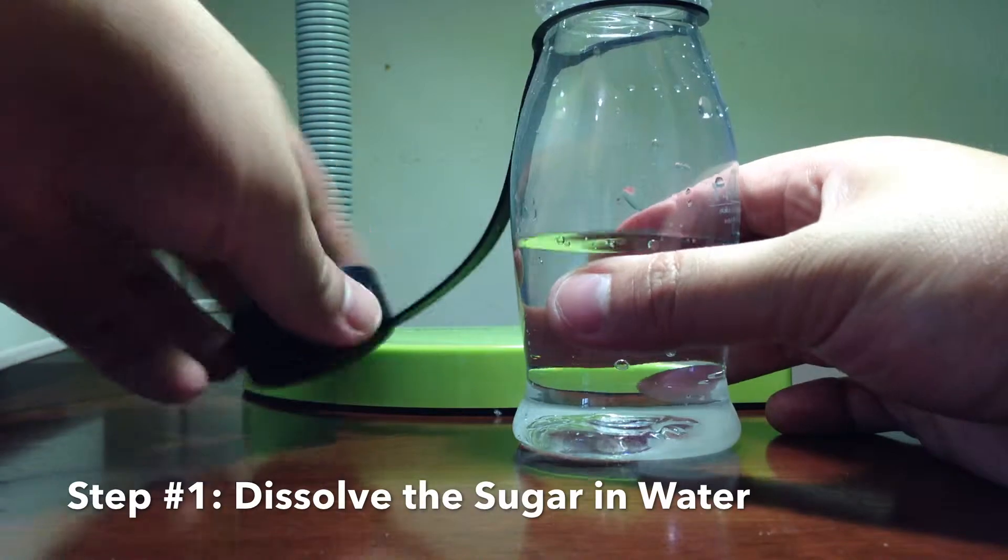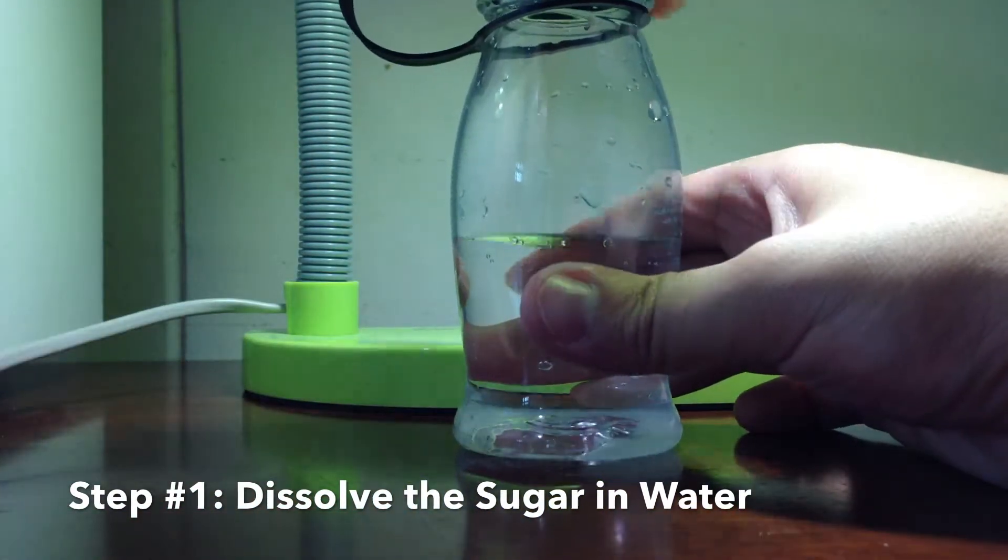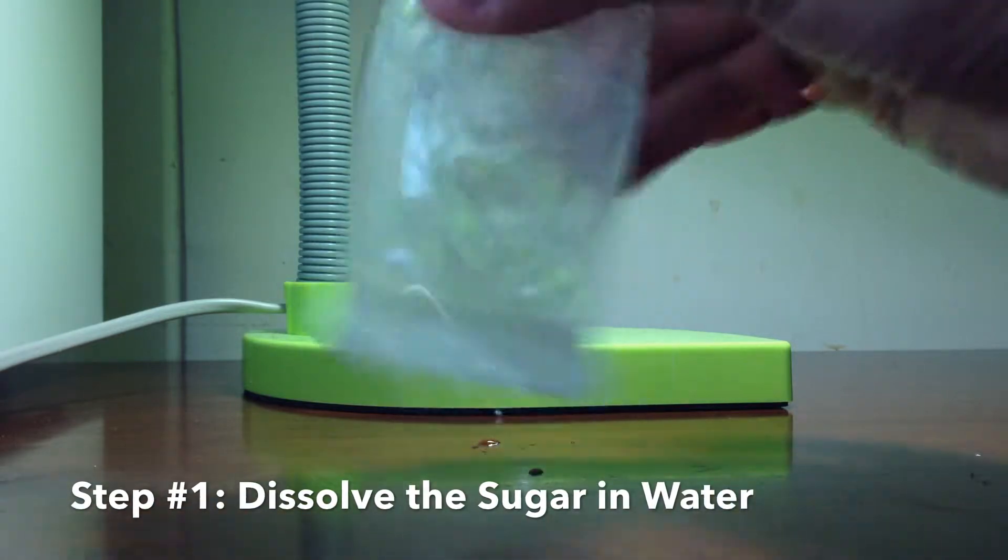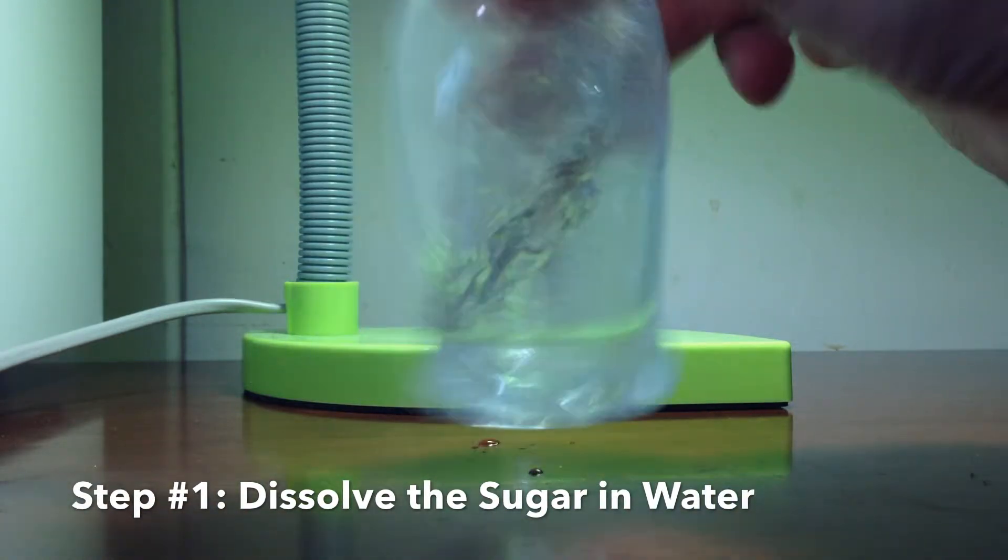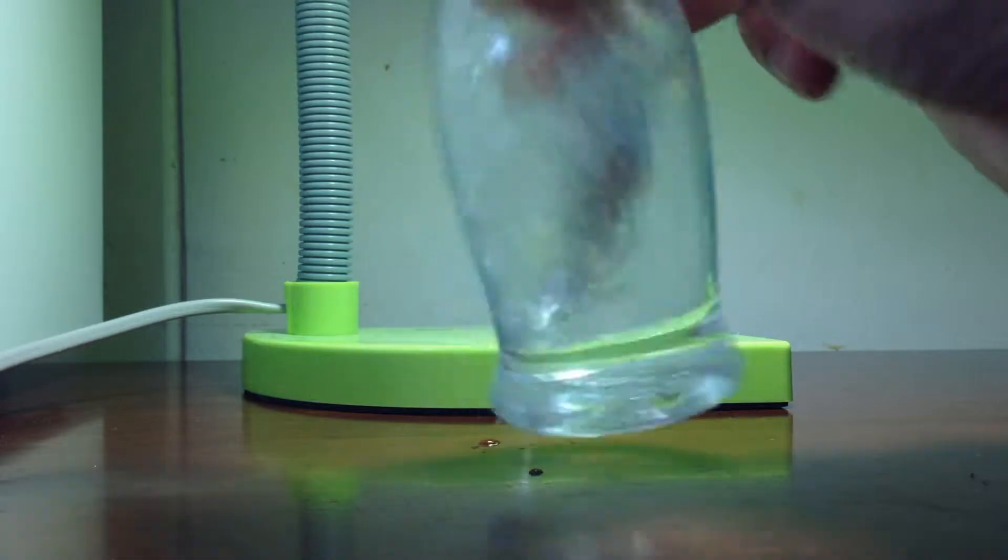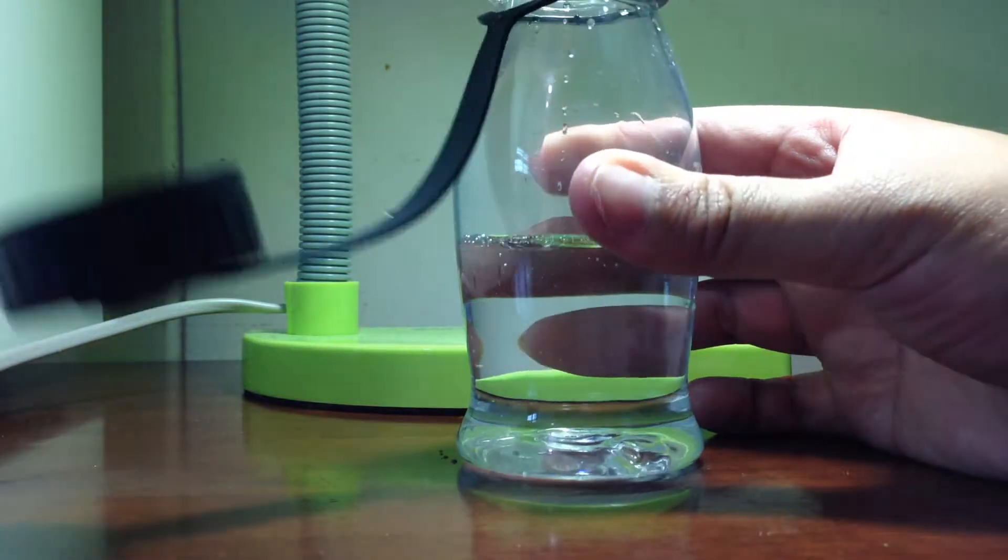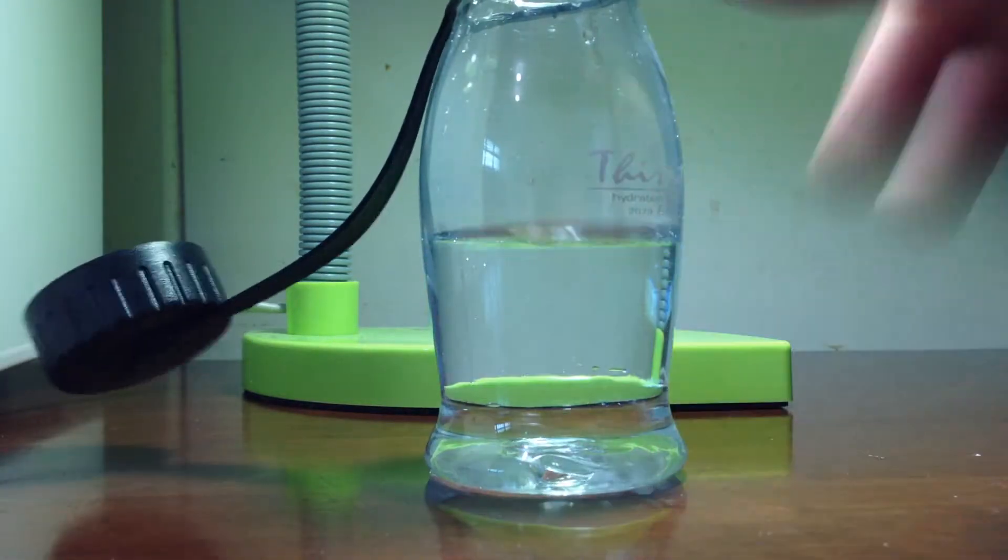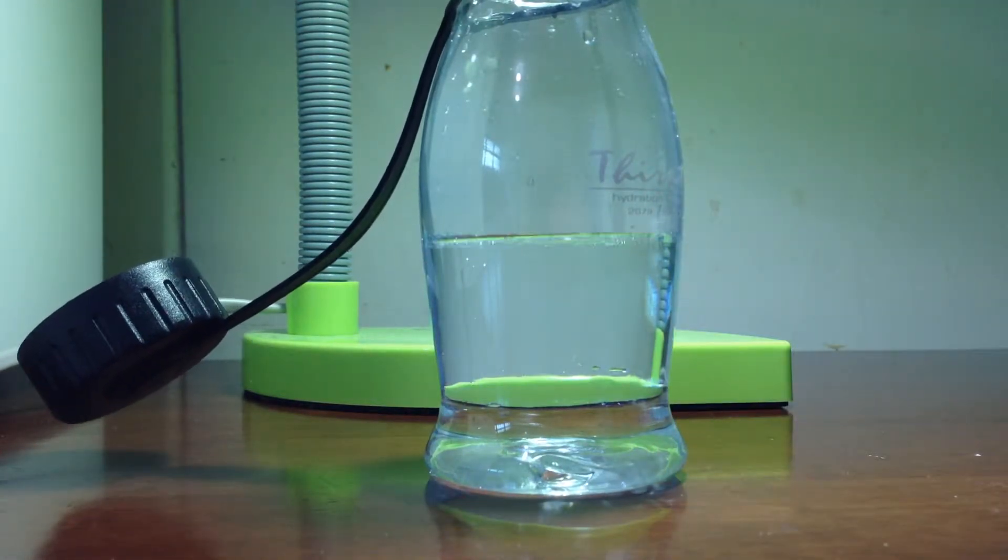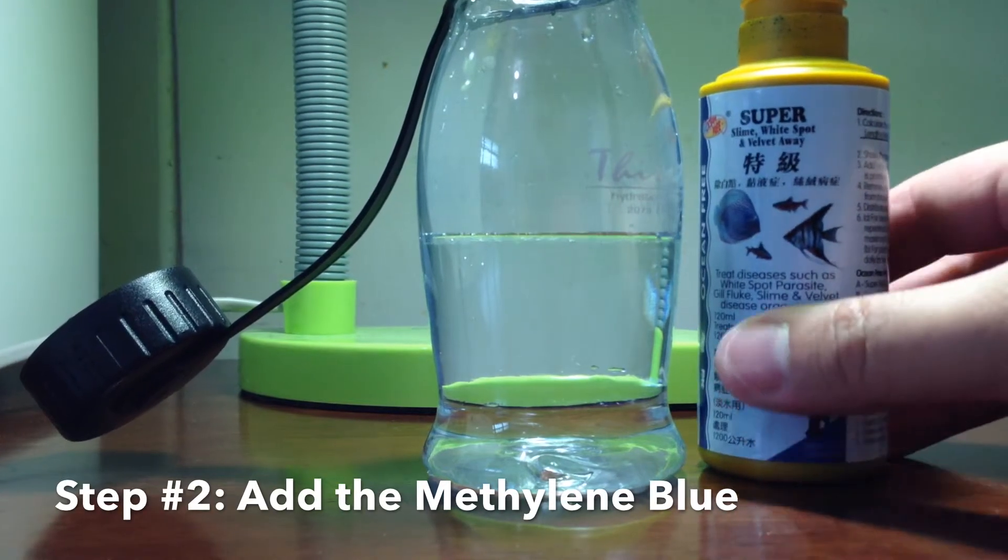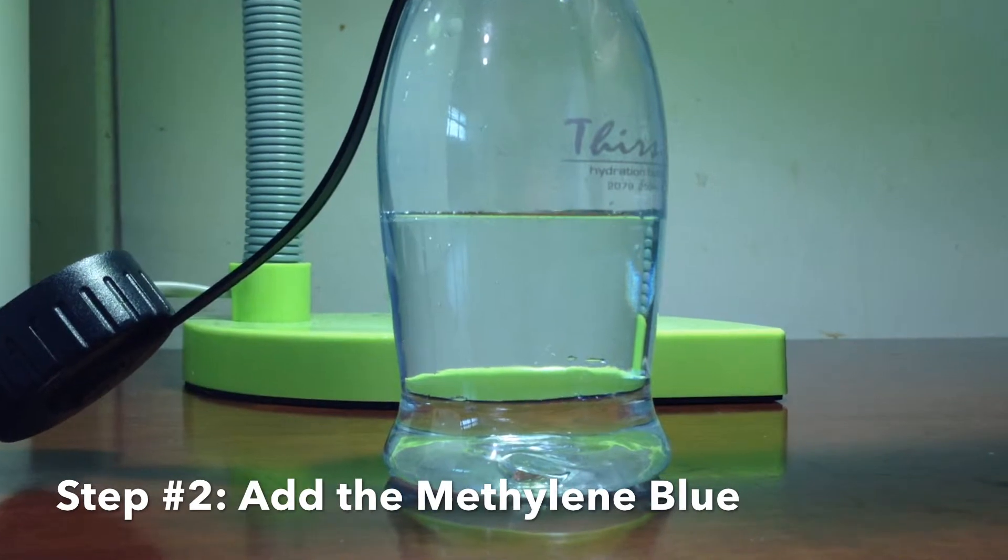Cap the bottle and give it a good swirl to ensure all the sugar is dissolved. Add about 2 to 3 drops of methylene blue.